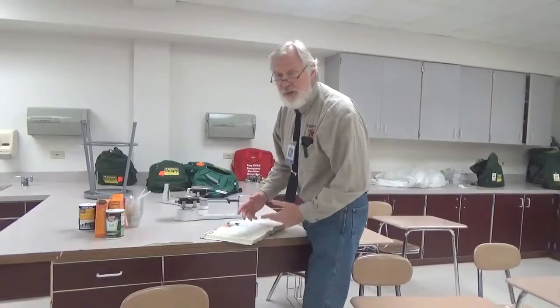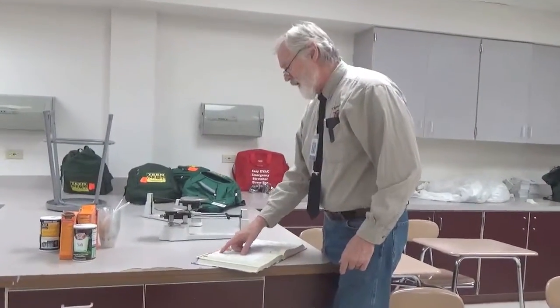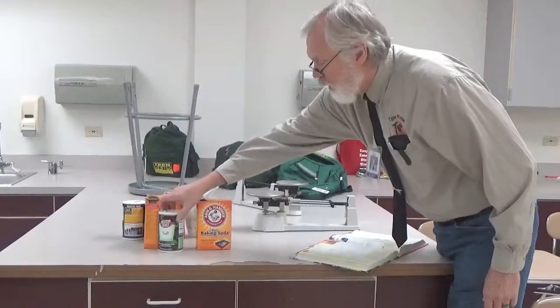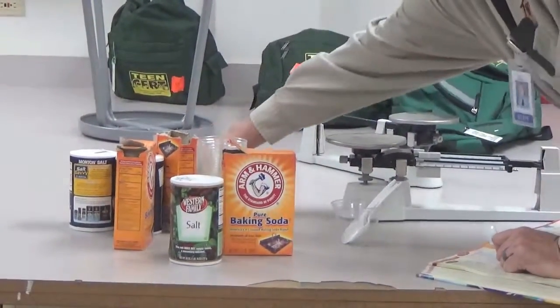Mr. Rasmussen, we had a lab yesterday, lab 10. The name of it was counting by measuring mass. What you were to do, you had three substances: water, baking soda, and salt. And you had to take a level teaspoon, that's why I had the rulers.